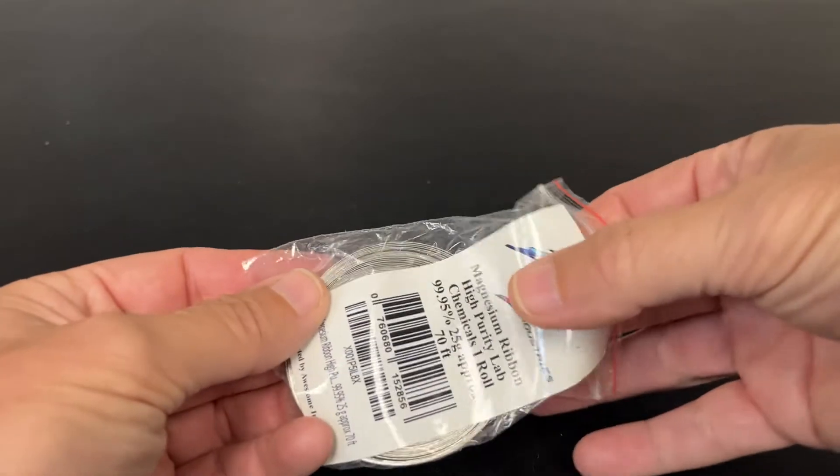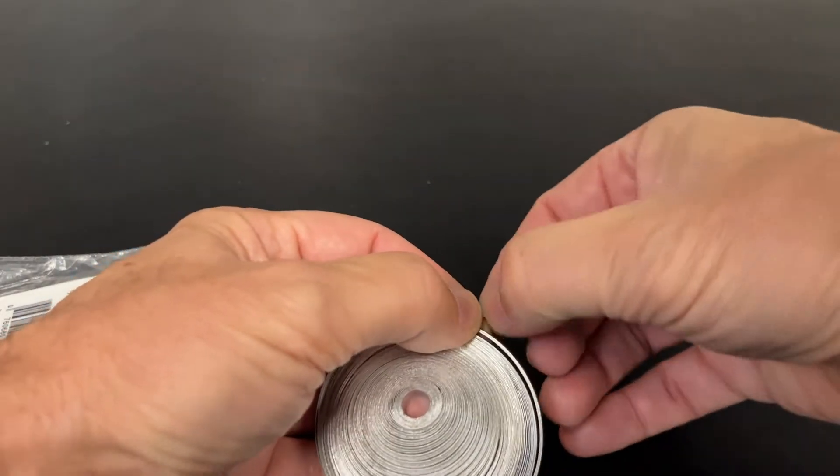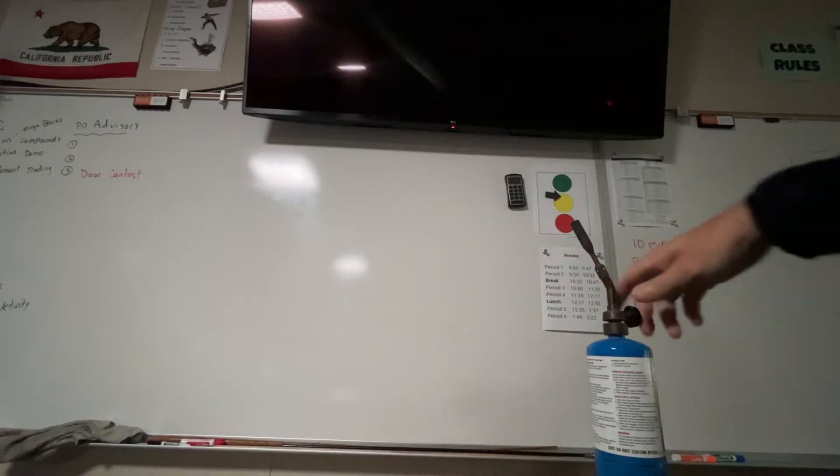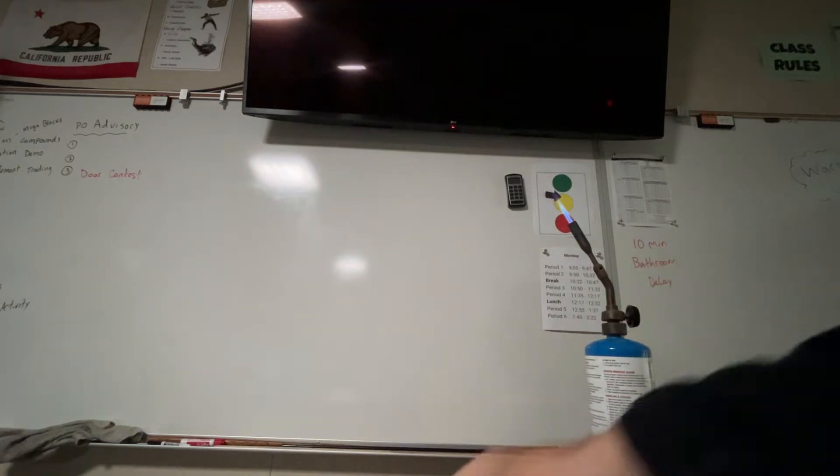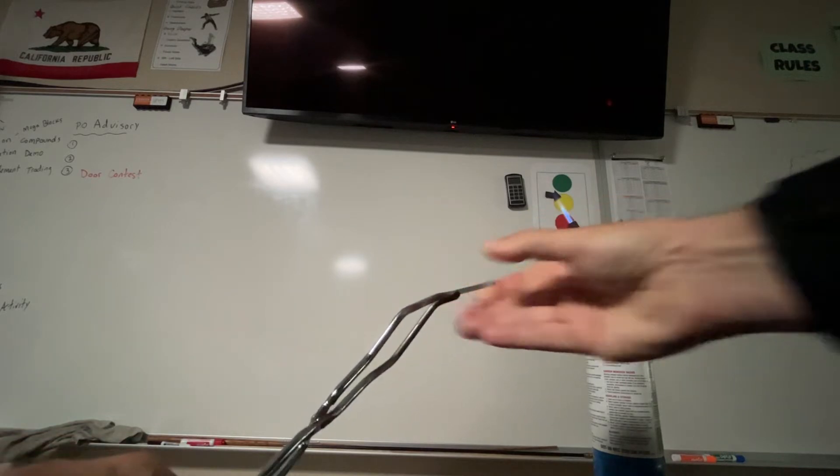All right, so I need to get a piece of this metal to experiment with. I'm just going to tear a piece off the ribbon. It's pretty easy to tear. Now I'm going to light this torch, and then I'm going to take the ribbon and put it in a pair of tongs and put it in the flame.